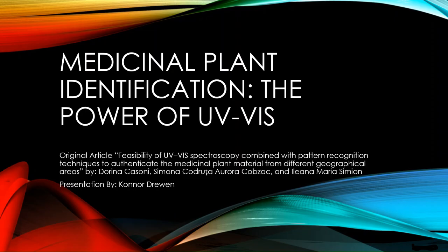For the uninitiated, UV-Vis, just a very quick and dirty explanation, is effectively a beam of light shot through a liquid sample, usually in a cuvette, sometimes a small microliter amount on a pedestal in the case of something like a NanoDrop, and then the amount of light that is absorbed can be used to determine a concentration through Beer's law. At least that is the 1% capability that we used it for in my industry.